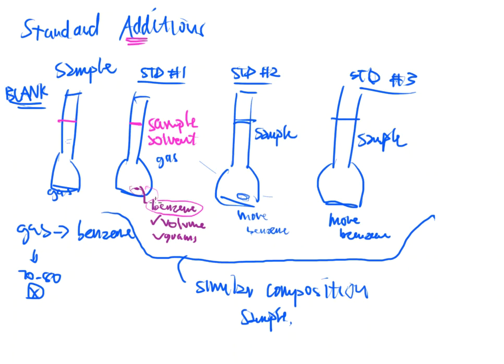There's your standard, there's the addition. This is another standard. It's gasoline with a little more benzene. There's your standard, there's your addition. And then this is another standard. It's gas that I've added even more benzene to than before. And there's the standard, and there's the addition part.